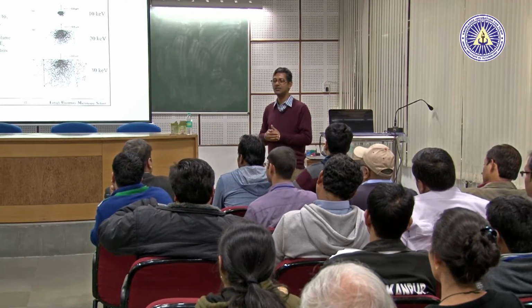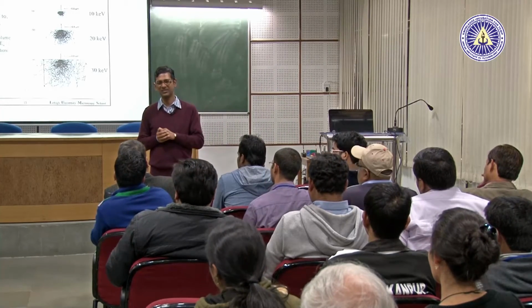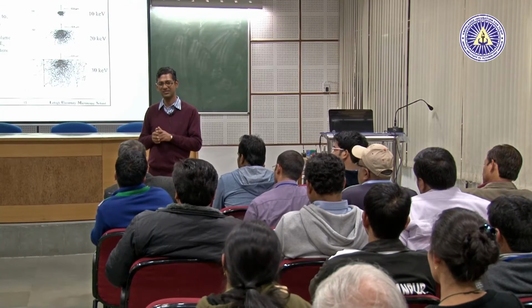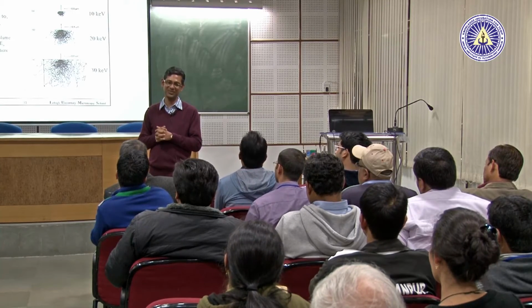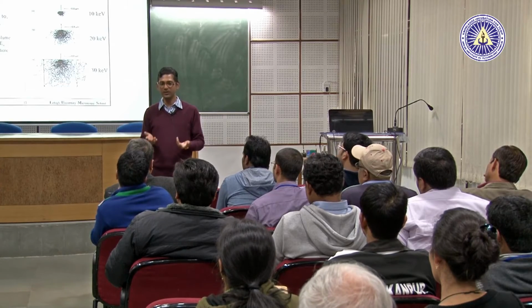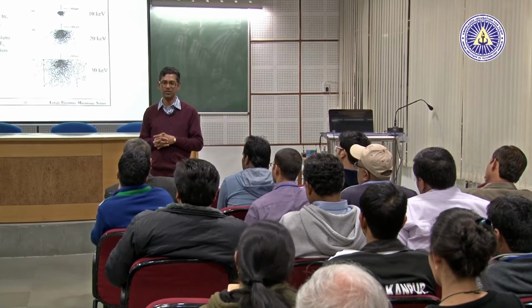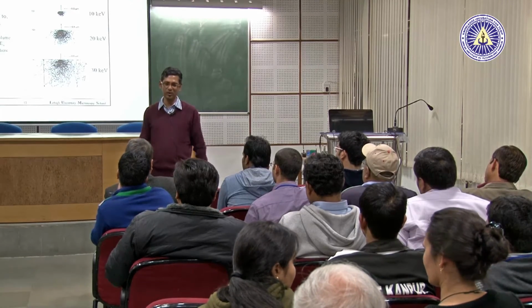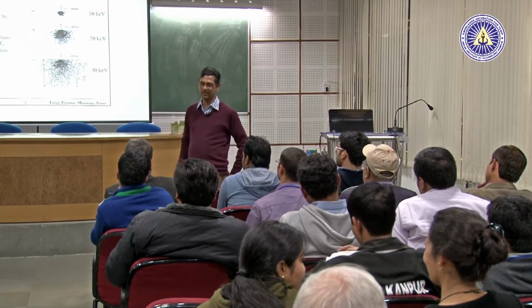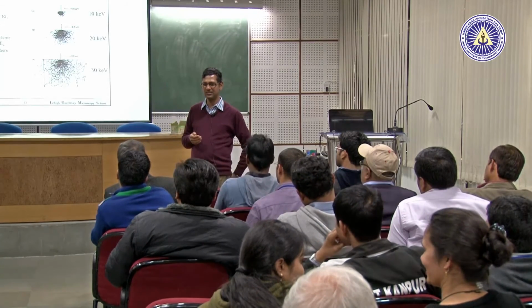The magnification you told is around 5 lakhs. 5 lakhs you can go on any machine. Is it optical magnification or digital magnification? No, optical magnification. Digital magnification can be very high. Nowadays even good SEMs' magnification can go up to 10 lakh times. It's possible, but routinely you can go to 2 lakhs very easily. And why can we not see the atom?